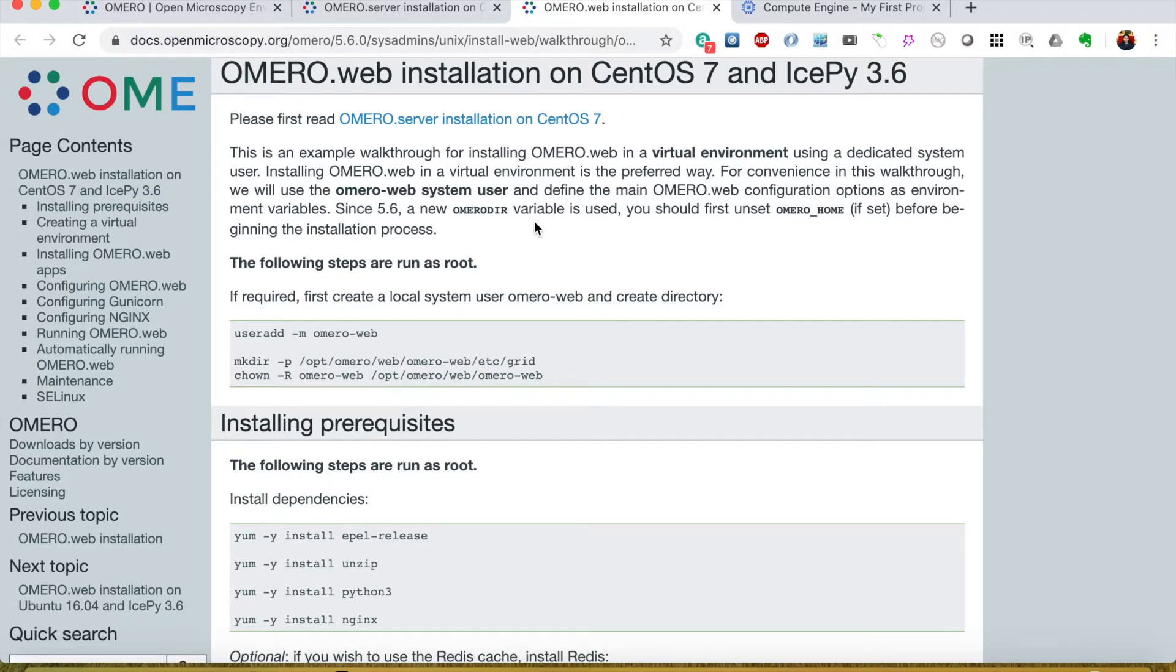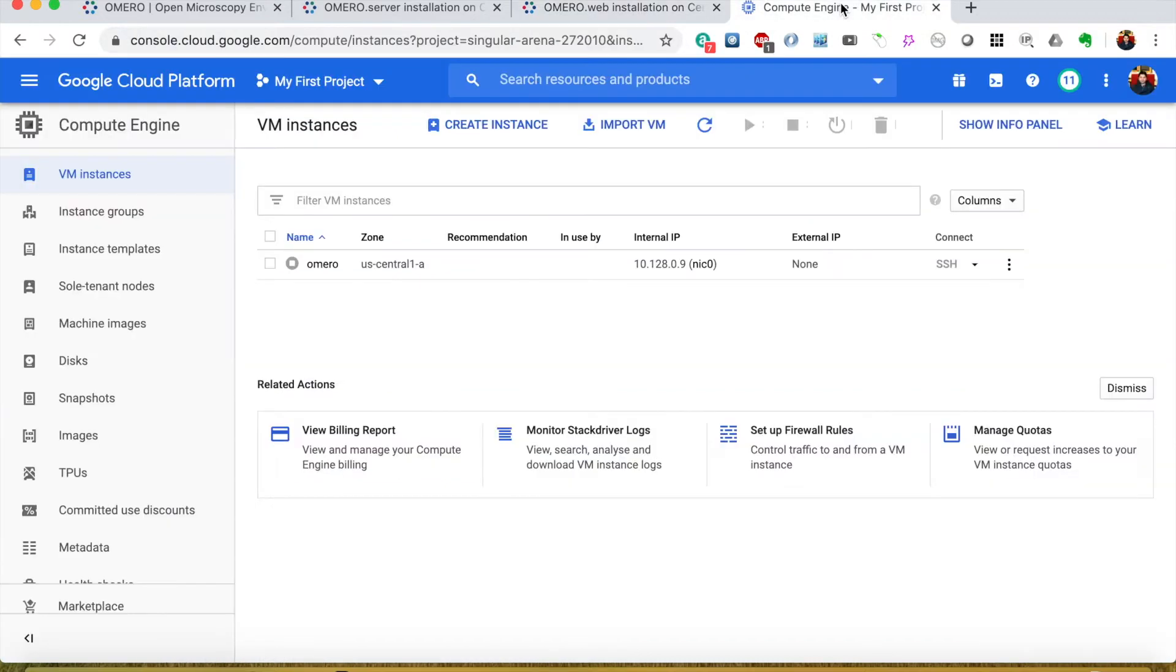I will do this installation on the Google Cloud VM so let's switch to Google Cloud and create the instance first.